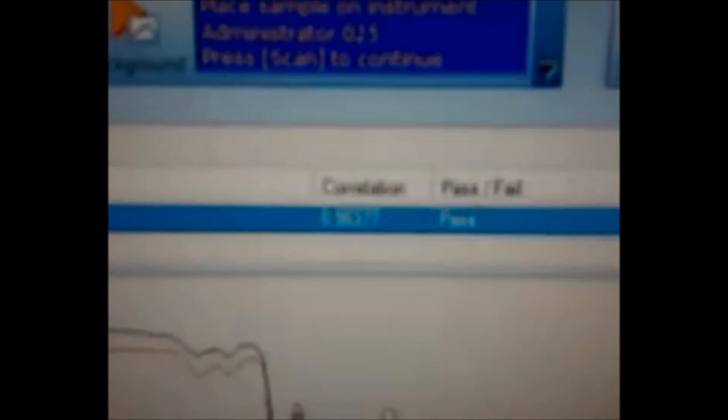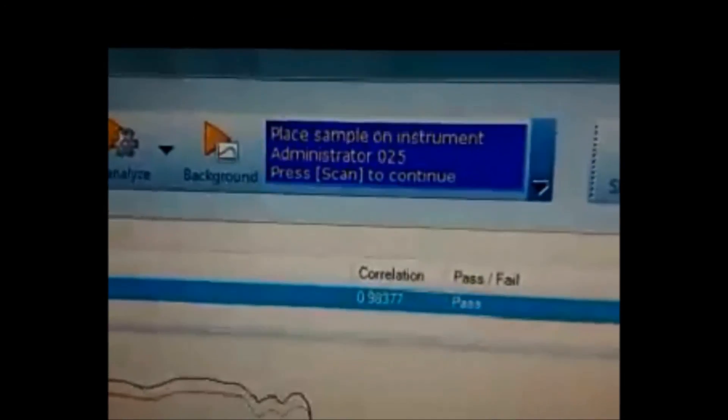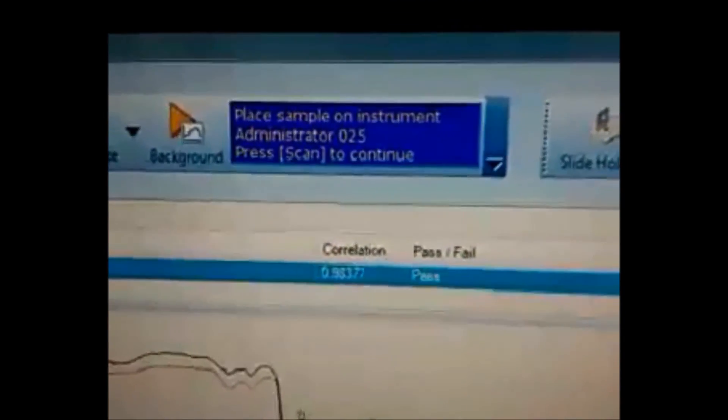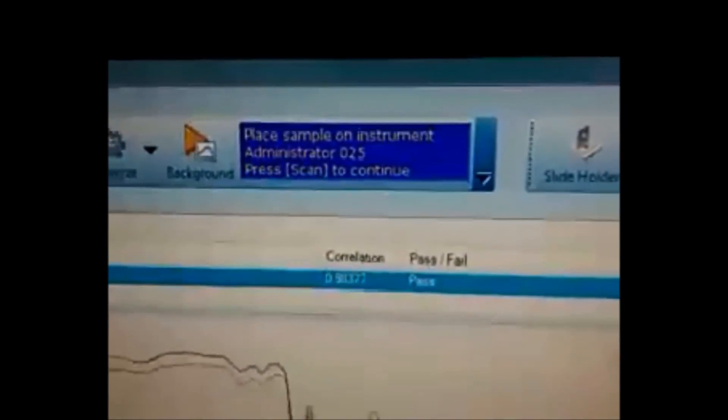So we have a correlation of 98%, which is good enough to show that the sample is matching its standard. And here, as we can see, it's matching.